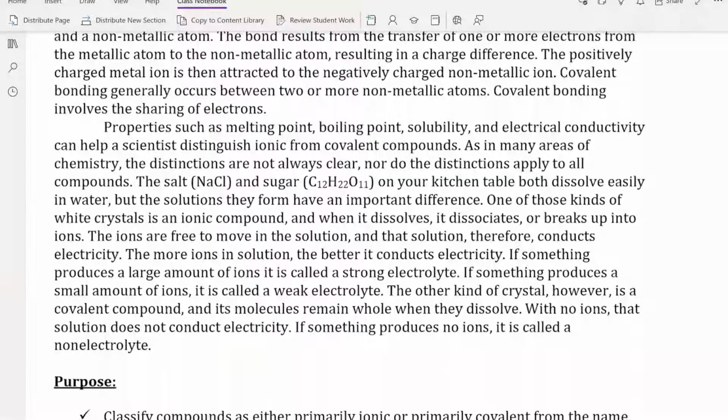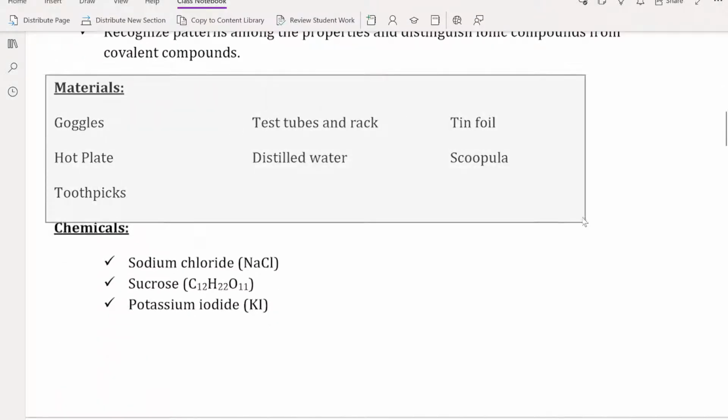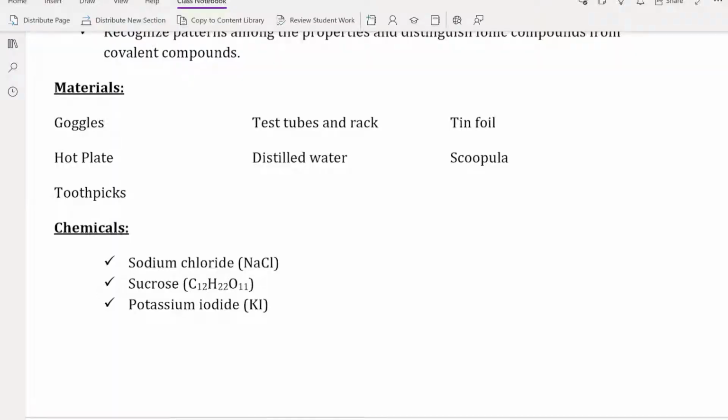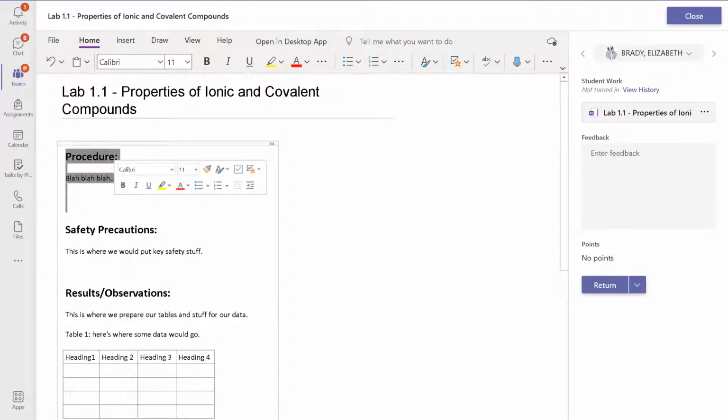All right? The point of your lab notebook is that it is the instructions that you need to follow, so that when you come into the lab, you can look at your lab notebook, know exactly what to do, and then down below in your lab notebook, you have a place to put all your data. So I would skip this introduction. I wouldn't even necessarily write the purpose, but I would definitely write the materials, because the materials are going to tell me what I need to get when we start the lab.